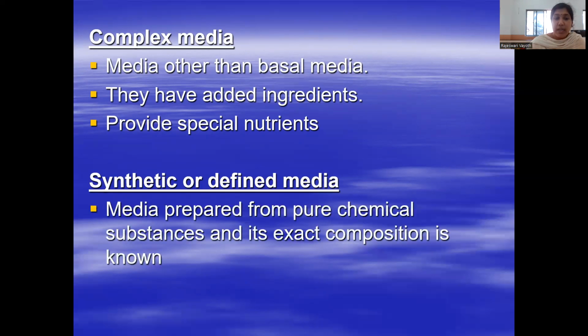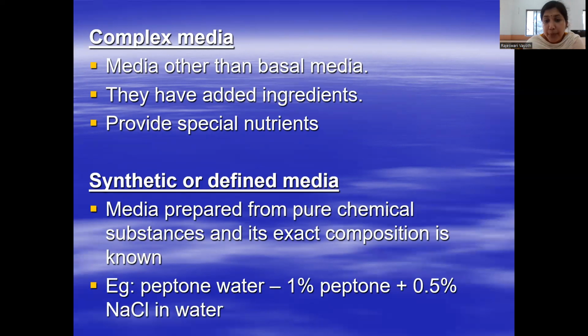Then synthetic or defined media are the media prepared from pure chemical substances, and its exact composition is known. For example, peptone water contains 1% of peptone and 0.5% of sodium chloride in water.